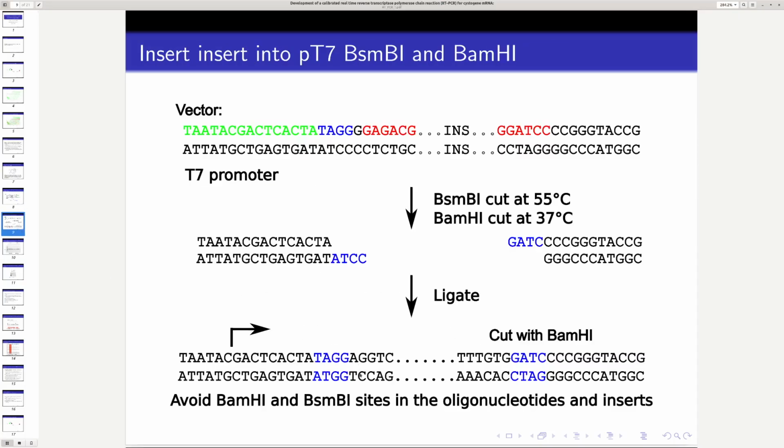Okay, and we actually use a technique called Golden Gate. And there's actually a little talk on that. It shows you how to do it. So in fact, it's a one-tube reaction. You just mix your plasmid with BsmBI and T4 ligase, and then you cycle between 16 degrees and 37 degrees 4 or 5 times, and everything that comes out from that reaction is perfect and will transform into E. coli. And you do have to sequence it, but 9 times out of 10 it's correct.